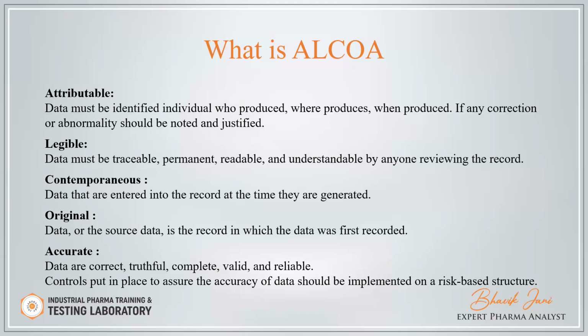And the next, contemporaneous: data are entered into the record at the time they are generated, meaning online data should be recorded. For example, you have to take the weight of any material. When you go near the balance, you have to enter all the details of your material in the instrument usage logbook, like the product name, date, batch number, AR number, start time, and the test.